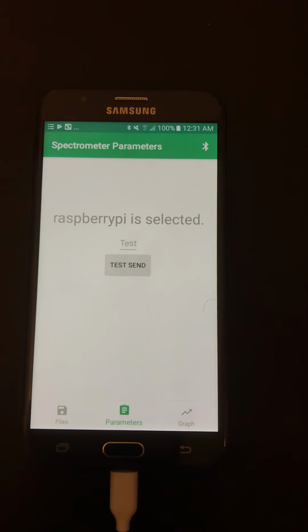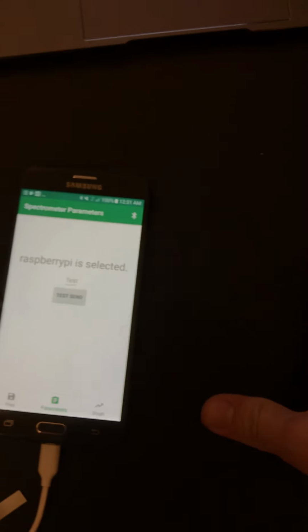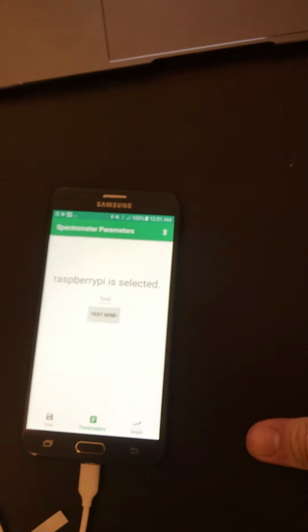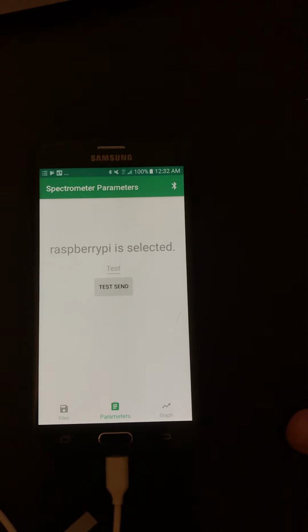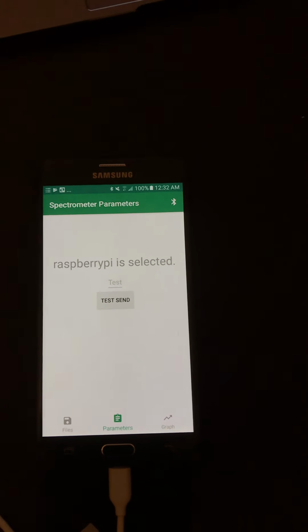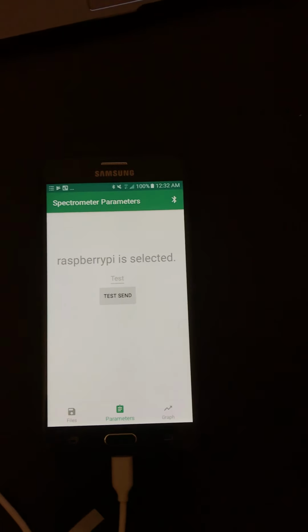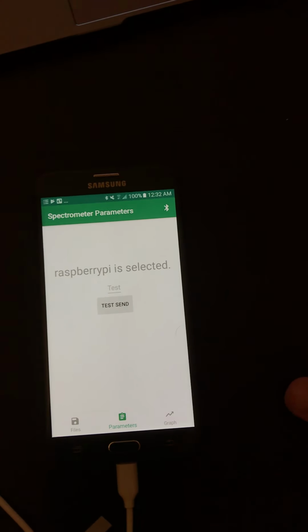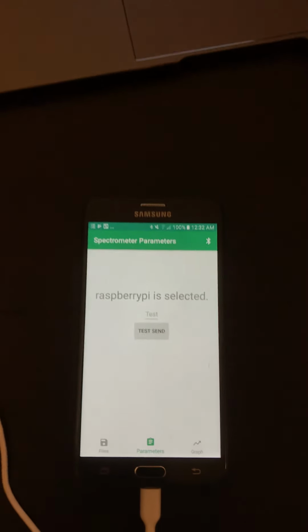And then also right now I'm having an issue where if the socket server closes, the app can't reconnect to the socket server. You need to shut down the app and restart it because you get an IO exception that we used to not get, because I'm reading in from the stream a different way, and closing it, it doesn't like it now. So those are the major bugs, and those are the major things that need to be fixed.